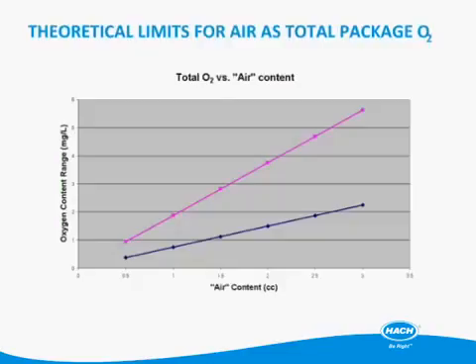You've got 80-20 ratio and the 60-40. So if we look at the bubble and we say we have a quantity of air and it all came from the headspace. So we had a package where we packaged perfectly. We got bubbles of air out of just the headspace. They would follow the blue line. They would show you what's in the headspace.